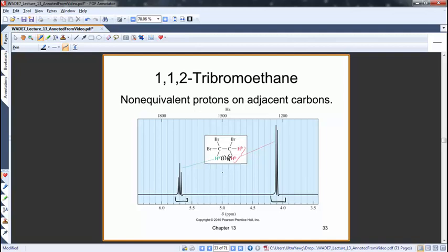So before we said HA has some value in the alpha state and some value in the beta state, and when we irradiate we turn all the alphas to betas, then we wait around and let the betas decay back down into the alphas, and we measure that using the detector, and that's when the detector says I see something and draws a signal, right? That's normally what we've been doing.